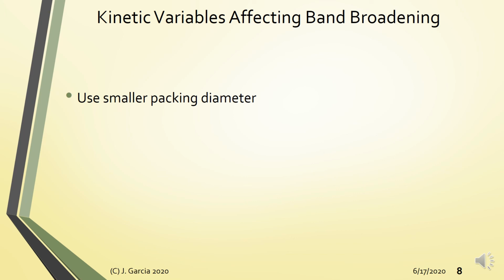All right. In liquid chromatography, the problem with using smaller packing diameters is that we usually experience higher back pressure, no? So mas mataas yung pressure ang required to push the mobile phase into the column, no, if you're using finer particles. So that is the development that is being utilized now with what you call your UPLC, no? Yung tinatawag na ultra high performance liquid chromatography.